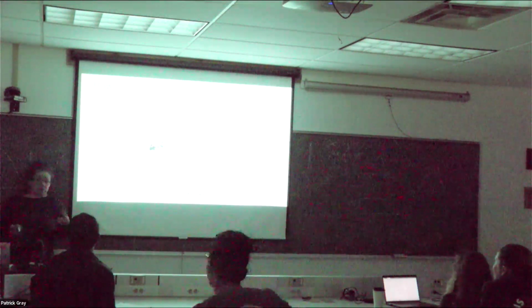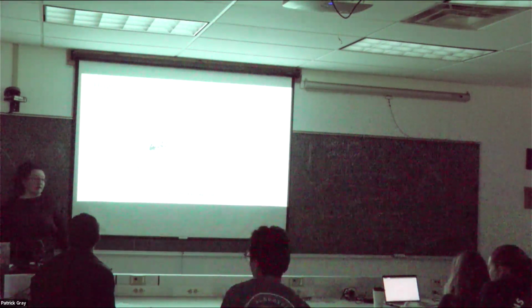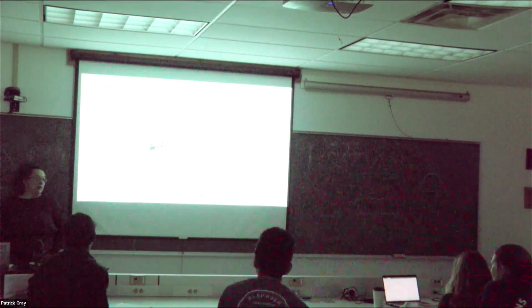Chlorophyll fluorometric, so extracted chlorophyll in acetone, is fast and cheap. It's $1.50. HPLC is around $100, €100 for Europeans. I did that conversion for you.